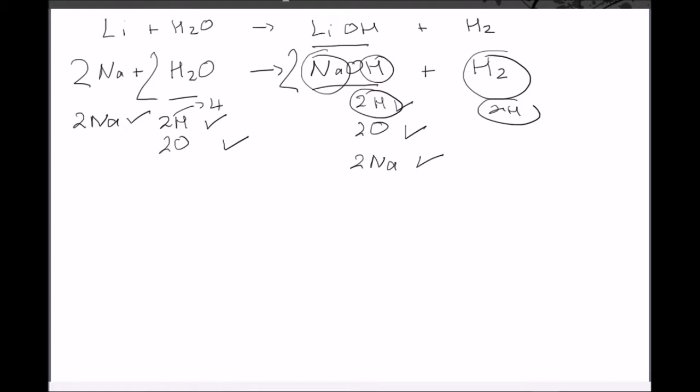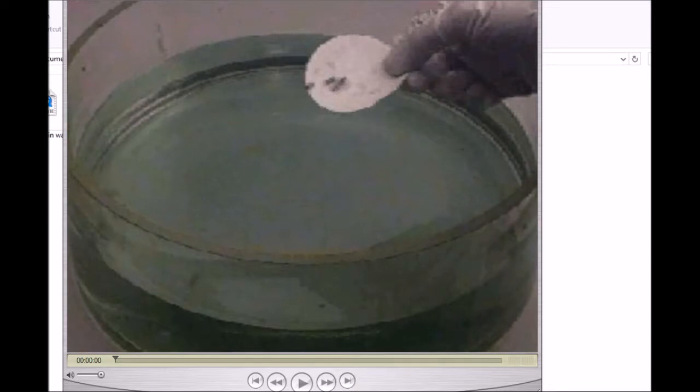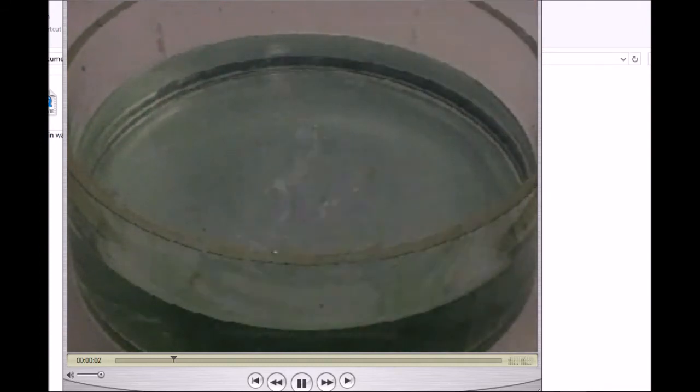Now the next reaction we'll move on to will be with potassium. So again, I load up the video of the potassium with water, have a look at it. This time I want you to have a look and see if you can get the observations, of course, but also if you can start now to come up with how the chemical reactivity changes as we move from sodium down the group to potassium. Okay, so if we have a look at the reaction of some potassium being popped into water here. So just let it run here, you can work out your observations.